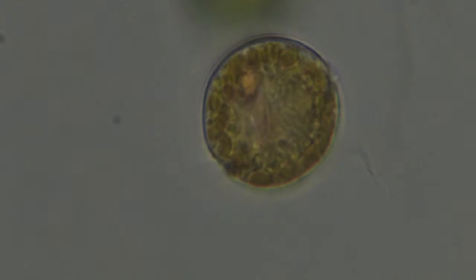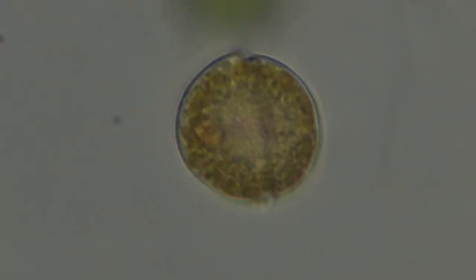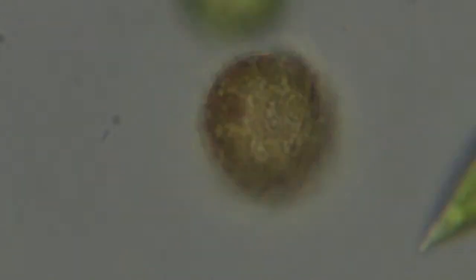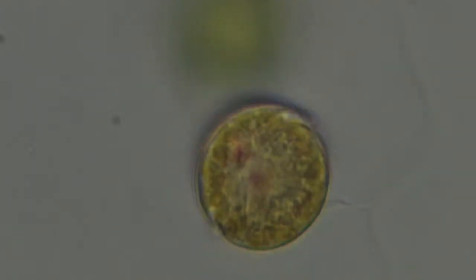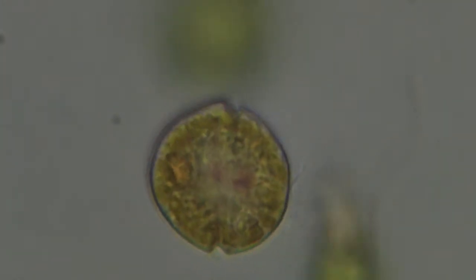So, it also has an eye spot right there. And you can see all the contents inside there. There's a Euglena for scale right next to it, all balled up. Still moving its parts, but all balled up for some reason. Yeah, now I've got really narrow depth of field, but so cool to get close to one of these guys. You don't see them very often. See, there's a flagellum sticking out on the right. You didn't bother by this. There's the constriction. If I focus through the constriction, you'll see.